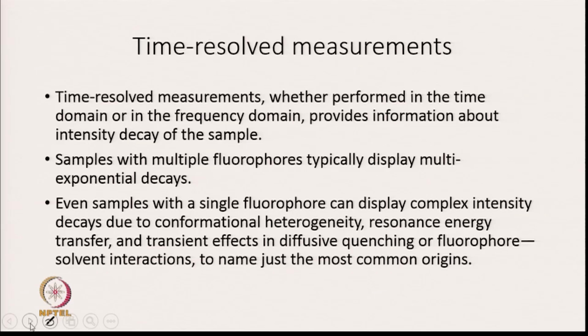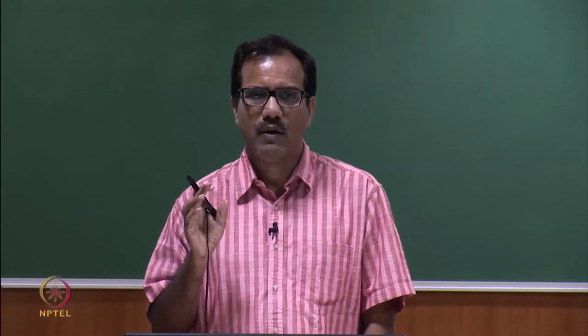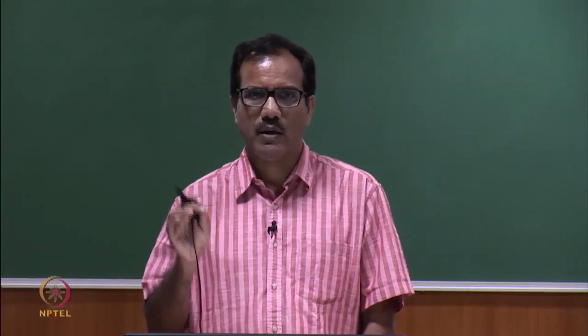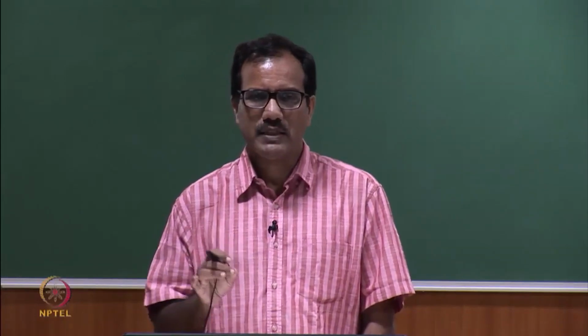Even samples with a single fluorophore can display complex intensity decay due to conformational heterogeneity. So, it is not true that if there is a single fluorophore, then it will always show single exponential decay. It may show a complex intensity decay because of conformational heterogeneity.